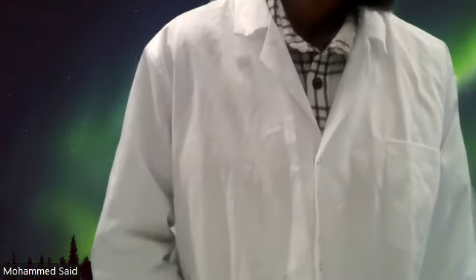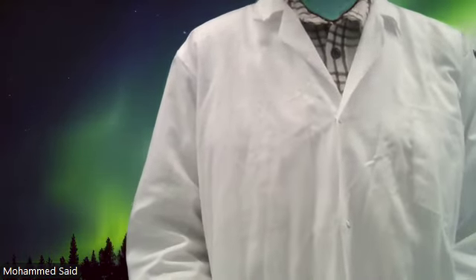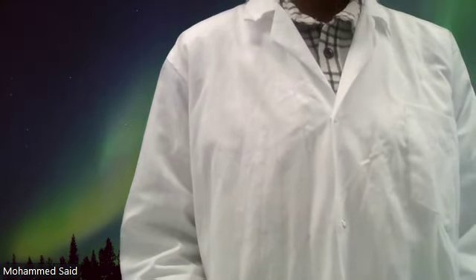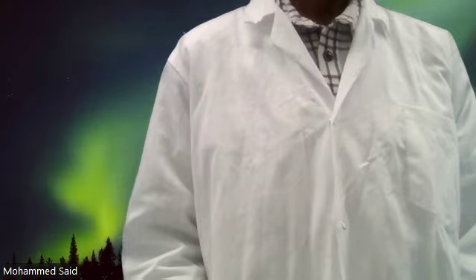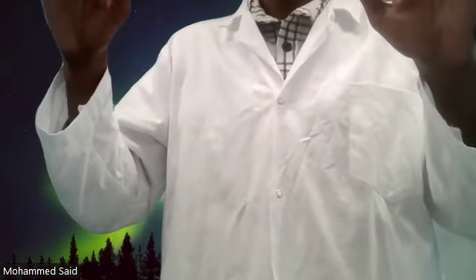Before I answer following questions, let's go straight to the gram stain, or sorry, the capsule stain. May I ask if everyone's done the gram stain or almost done? Raise your hand if you're now in the capsule stain or already done that, which is also good. Either way, if you're in the process of doing your capsule stain, raise your hand.